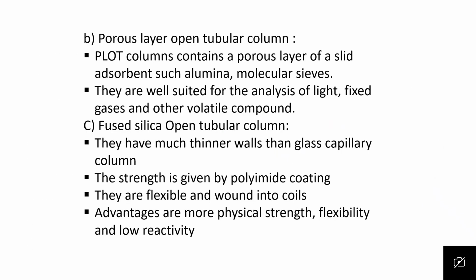Porous layer open tubular column. PLOT columns contain a porous layer of a solid adsorbent such as alumina or molecular sieves. They are well suited for the analysis of light, fixed gases, and other volatile compounds.